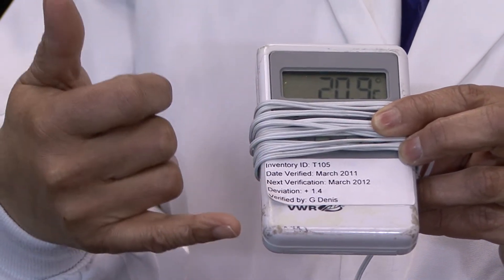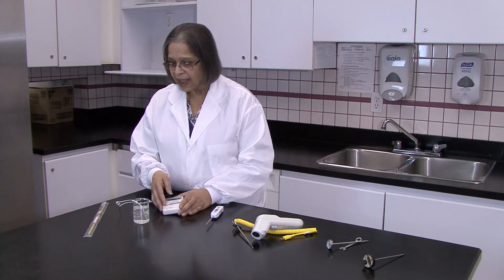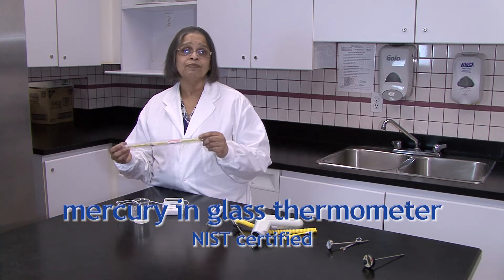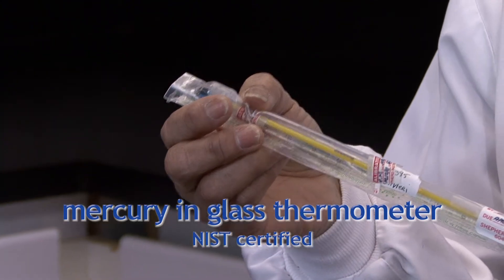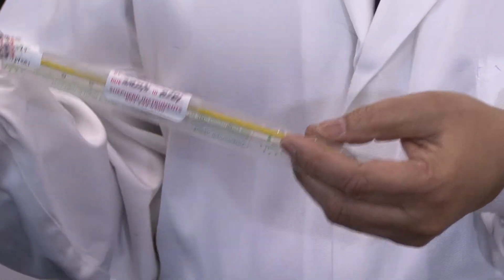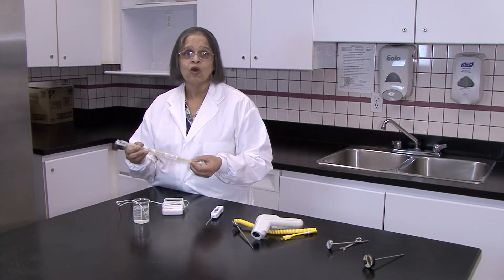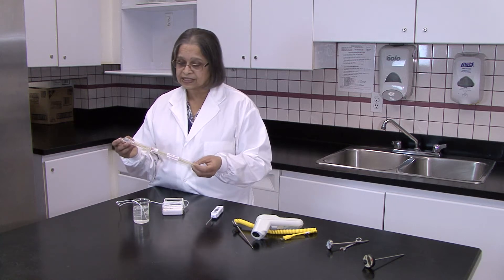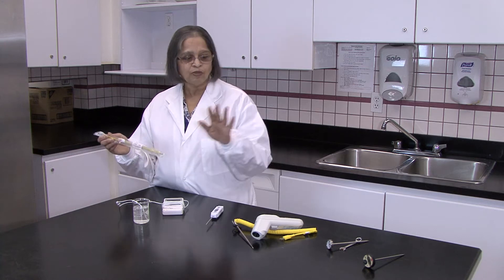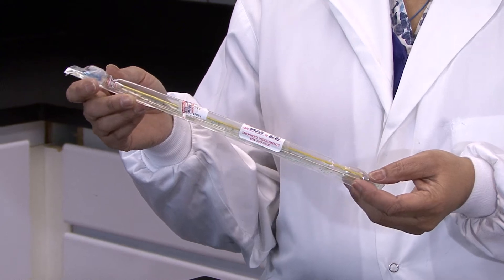This information may be recorded on the label as shown here or in a calibration log. Our last thermometer is a NIST certified mercury-in-glass thermometer. This has been one of the standards in the food industry for years, and it is used most often to calibrate other thermometers. It comes calibrated with a serial number and a calibration certificate. If you have one of these, calibrating your other thermometers out on the floor becomes very simple.